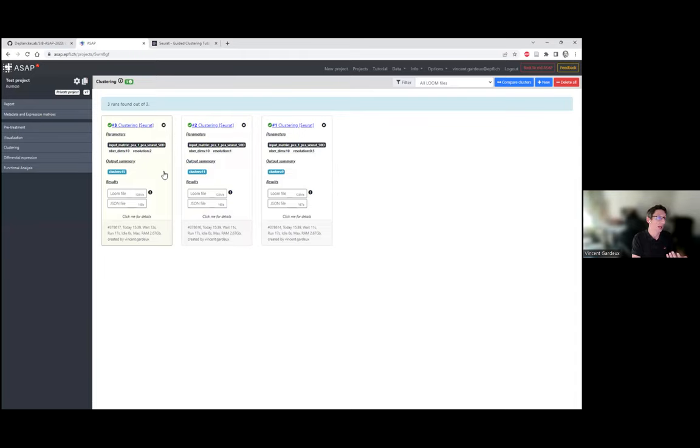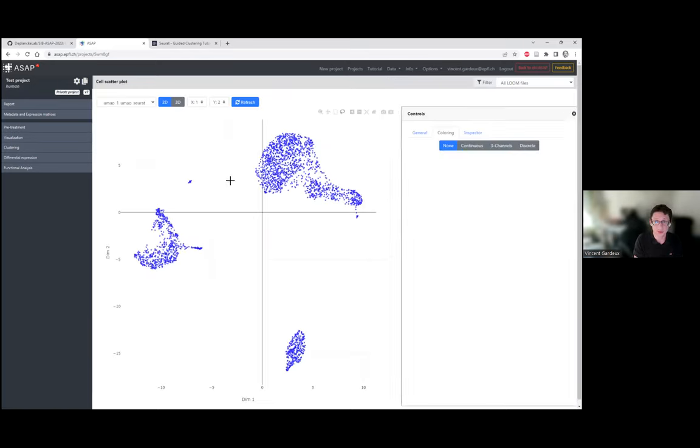So that's a part of the pipeline where it gets very arbitrary, because then you will need to go back and forth, as I showed you before, trying to guess or to fit the better number of clusters.